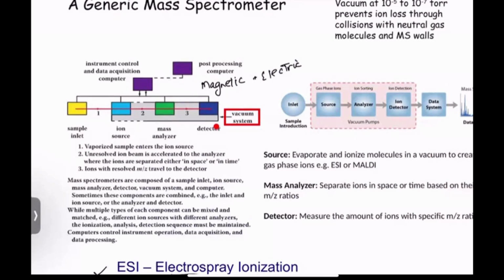This is a mass spectrum. It is simply the M to Z ratio of the ions present in a sample plotted against their intensities. Each peak, what you see here in a mass spectrum, shows a component of unique M to Z in the sample, and the heights of the peak are correlated to the relative abundance of the various components in the sample.